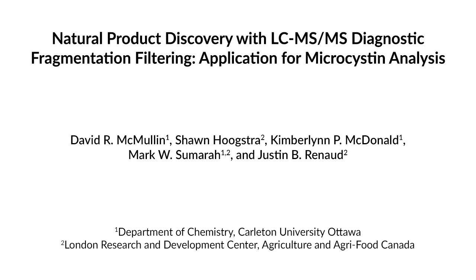Natural products are often biosynthesized as a class of compounds and not as a single product. Diagnostic fragmentation filtering is a simple approach for detecting all structurally related compounds within a complex mixture. Diagnostic fragmentation filtering, implemented within the MZmine software, allows the analyst to explore mass spectrometry datasets for new natural products that would otherwise be missed.